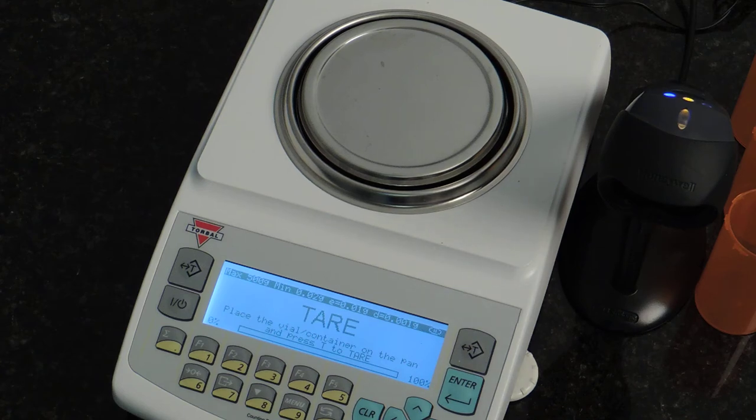In this video we will be performing pill counting to show you how quickly and easily it is to count pills on the DRX500S series scales. I have three different pills and I will be performing three different counts of 30, 60, and 90.